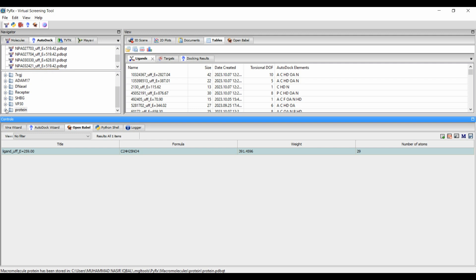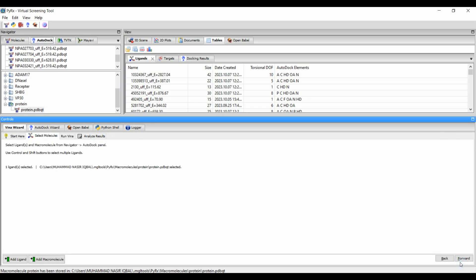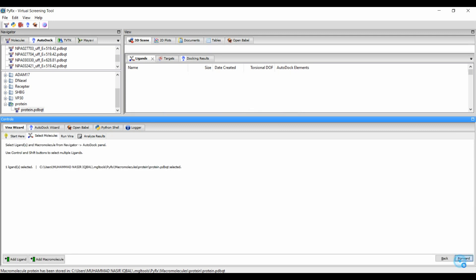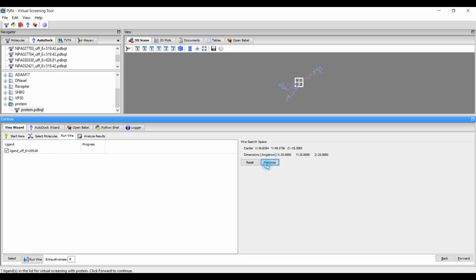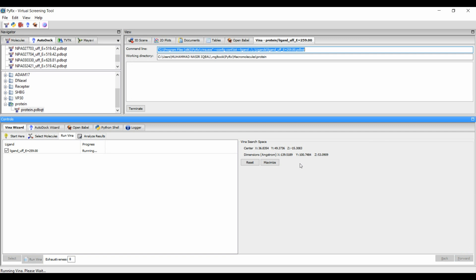Select your ligand, and from the macromolecule tab select the protein receptor molecule. Then go to the Vina Wizard and click Start, click Forward, maximize, and then click Forward again. The docking of the receptor molecule with the ligand molecule will then be started.